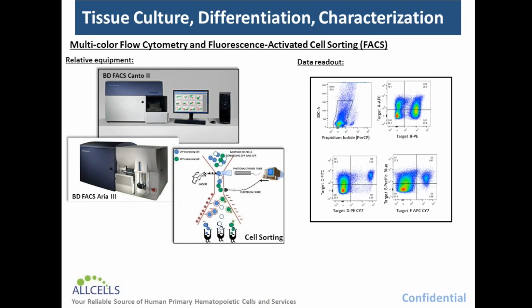In generating the different lineages of primary cells, a number of assays and tools are available to characterize the phenotype. Multicolor flow cytometry is a common technique in which cell lines are phenotyped. This involves detecting fluorophore-conjugated monoclonal antibodies that bind to extracellular or intracellular proteins, a common example being the cluster of differentiation molecules. The basic output from flow cytometry allows the scientist to visualize and quantify differences between cells based on protein expression, size, and granularity.